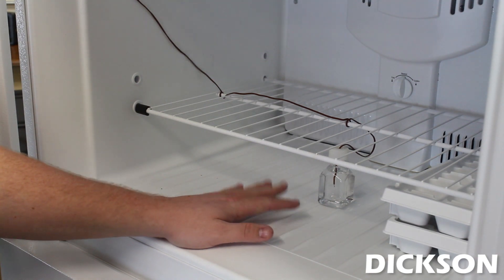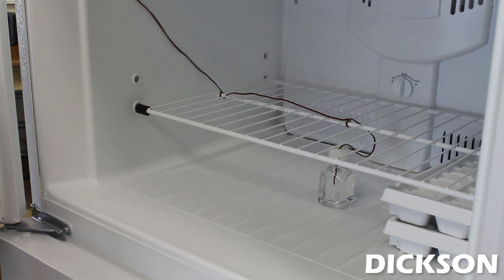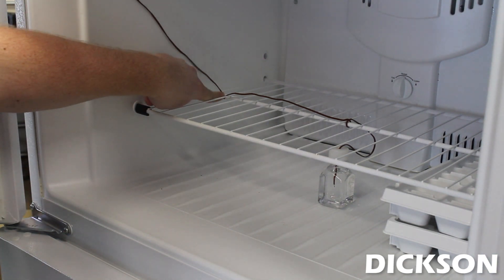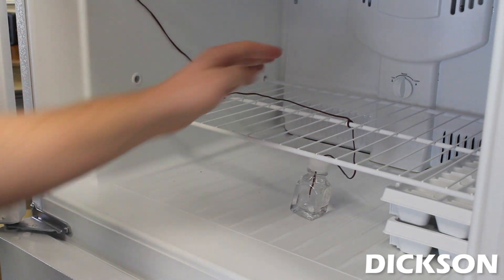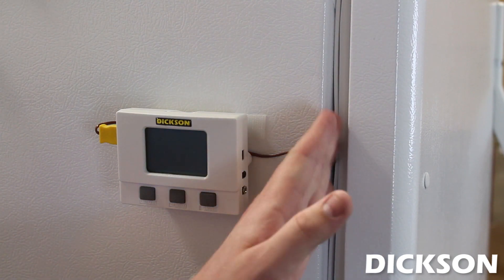Then put the probe wherever you require. I'm putting it right here in the center, but it's always best to check with your auditor to see if there's a certain location that you need to monitor it at. I also see people, after taping the probe to the side, just wrap it around the cage here and wrap it over. This wire is very pliable, so you can pretty much manipulate it whatever way you'd like. Although the seal looks like it is affected here, it actually is not affected whatsoever. The inner seal is doing a good job of keeping air from coming out.